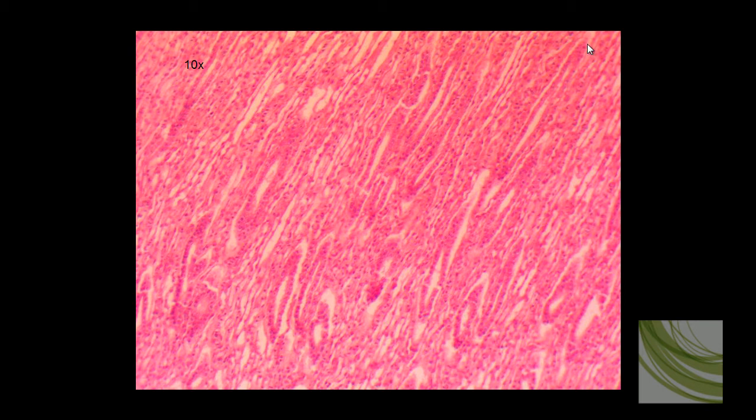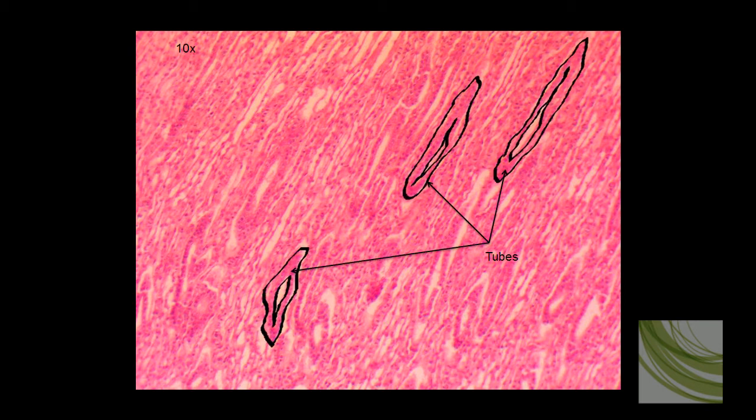Now, using the 10X objective, we can see some of these tubules more clearly with a little lumen or space inside, and we can see this single layer of cuboidal epithelium in these flattened tubules. I've got quite a few tubules here we can see, and I have actually outlined a few of them for you.